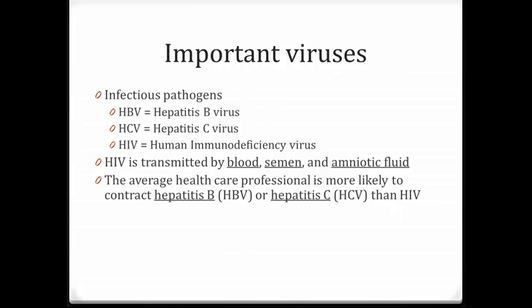HIV is transmitted by blood, semen, and amniotic fluid. Blood is the single most important source for HIV and hepatitis B in the occupational setting. The average healthcare professional is more likely to contract hepatitis B or hepatitis C than HIV. Hepatitis B can be present in extraordinarily high concentrations, while HIV is usually found in lower concentrations, hence less likely to contract.